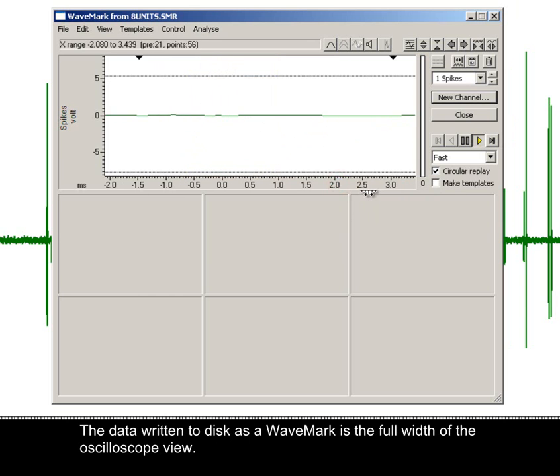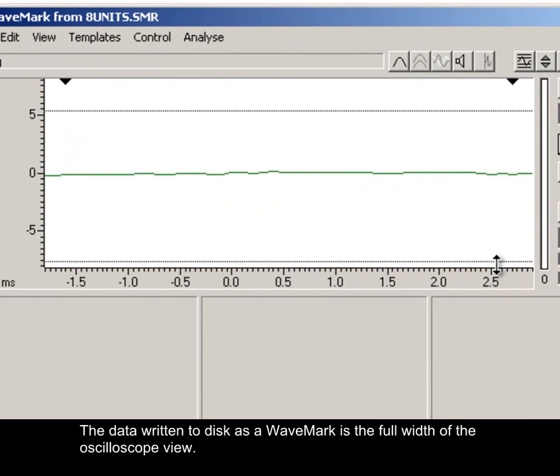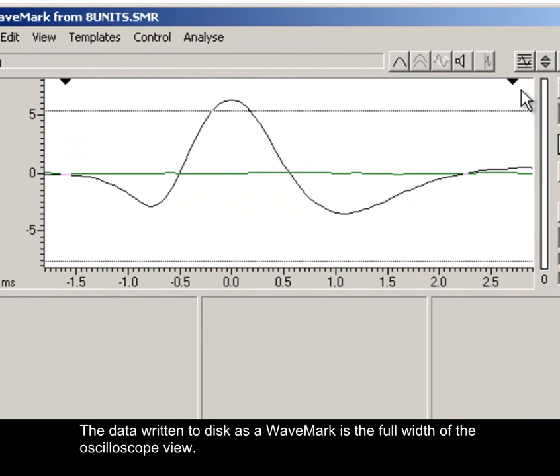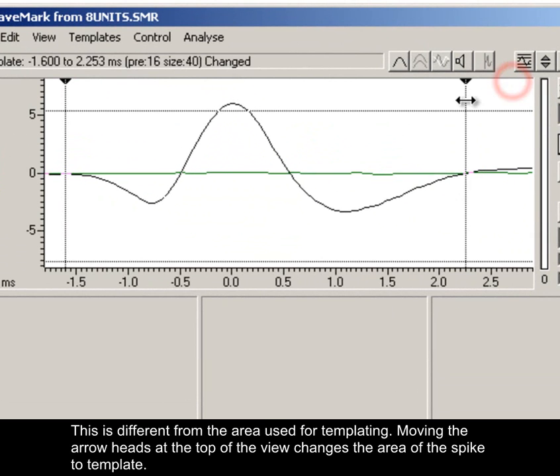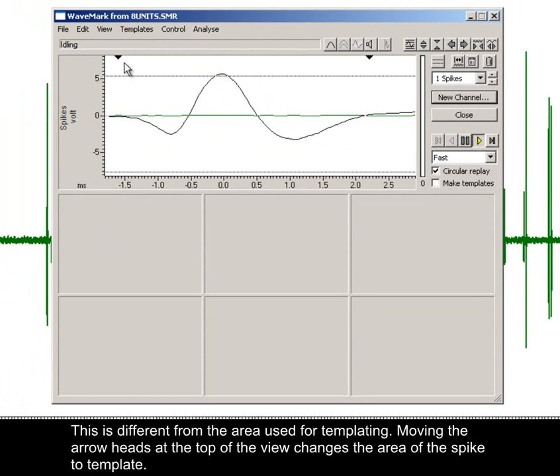The data written to disk as a wave mark is the full width of the oscilloscope view. This is different from the area used for templating.